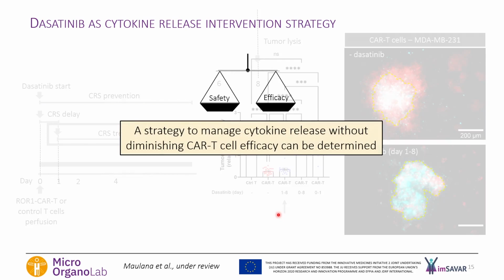By testing that, we were able to find the optimal strategy to manage cytokine release without really diminishing the CAR T cell efficacy. So, this could potentially also be applied to other safety measure strategies.